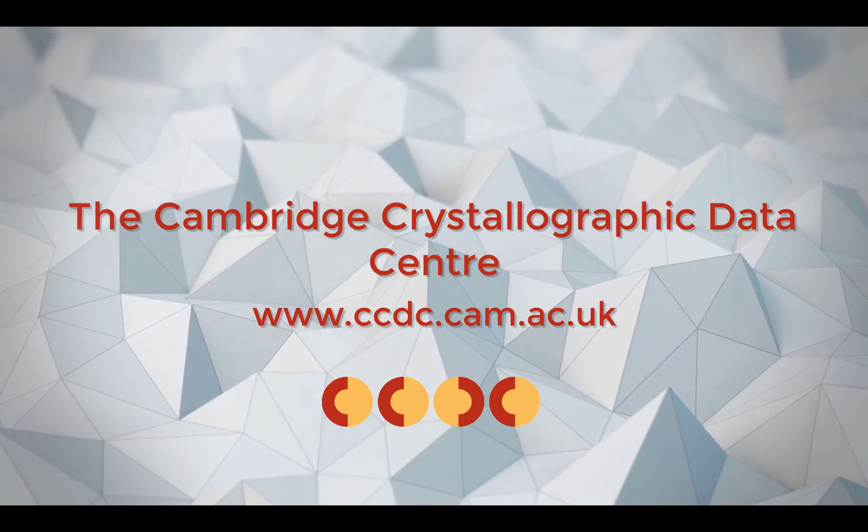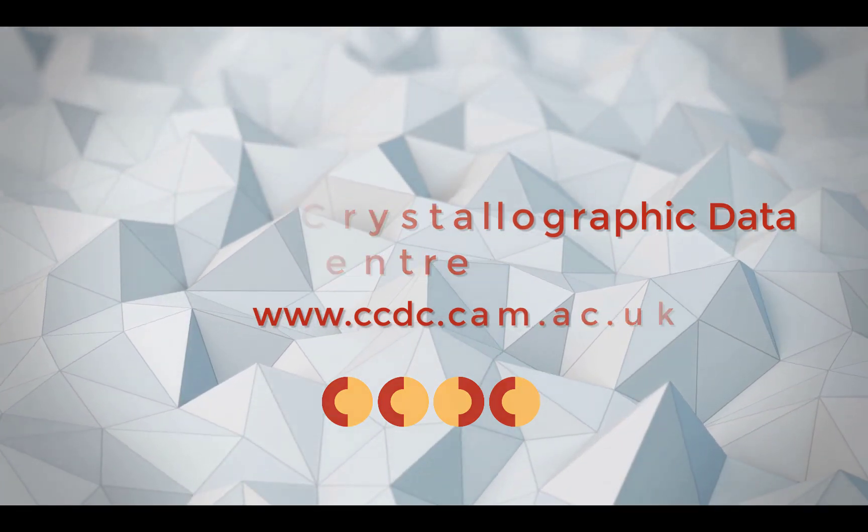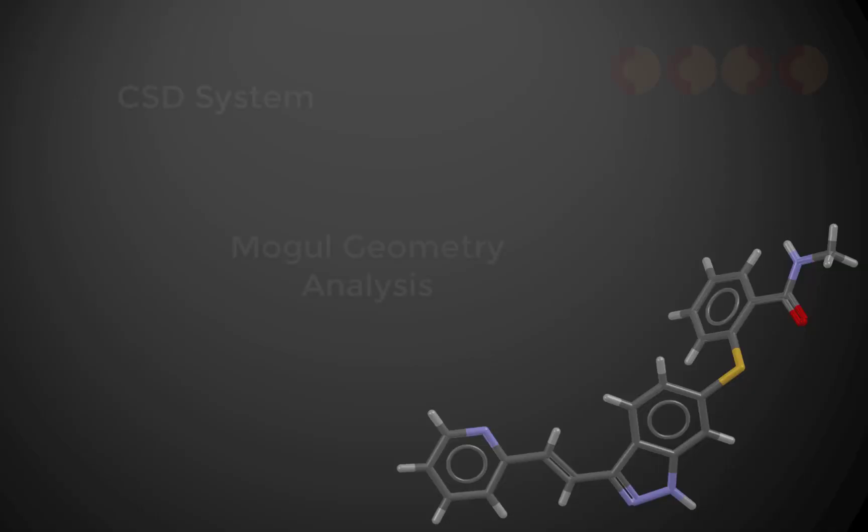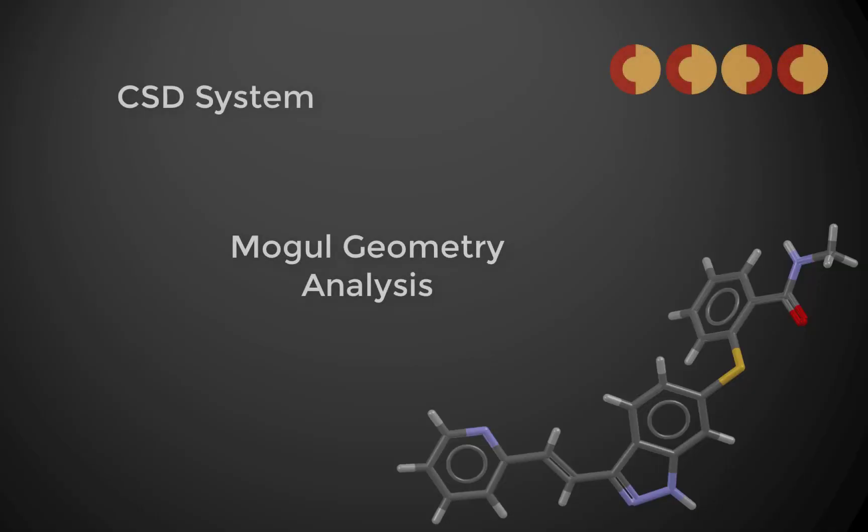Hi, this is Amy Sargent, doing outreach and education for the CCDC. I'm going to show you how to use Mercury to run a Mogul geometry analysis. Let's get started!